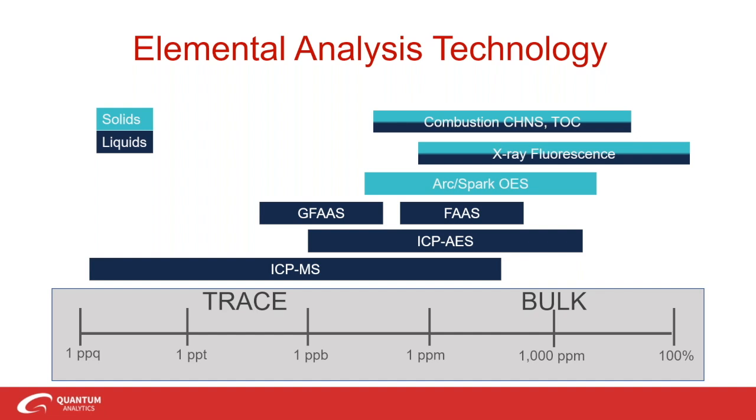When the required limits of quantification are above 1 ppm or non-destructive analysis is required, XRF is a very attractive technique. It's one that should really be considered, especially when analyzing solids, powders, slurries, filters, and oils, a wide range of these types of materials.